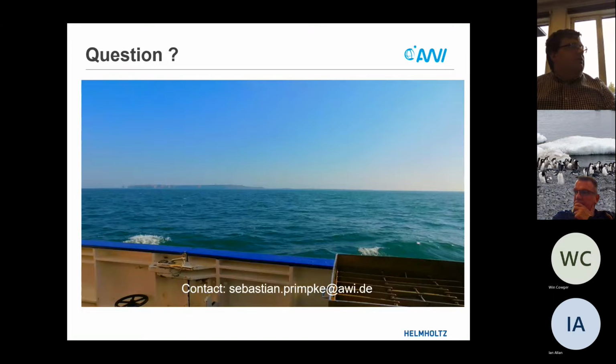And I think this will be difficult to solve by pure computational science. But we would need a flag, so when this method decides something is off here, it gives you a hint where to look, that you should check this part. So that you really only get a selection of where you should check your data, and the other is considered safe. Because otherwise we have a lot of remnants somewhere.